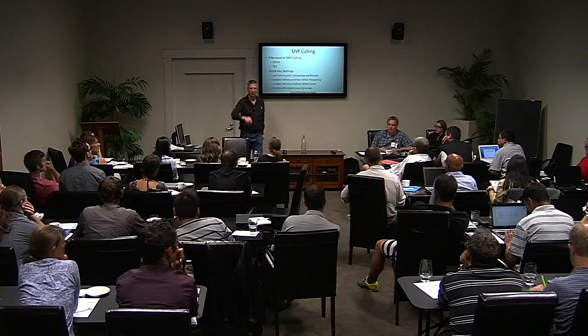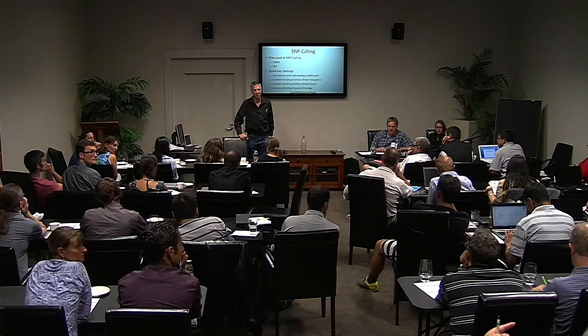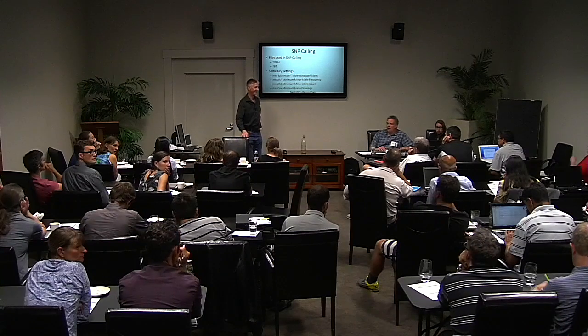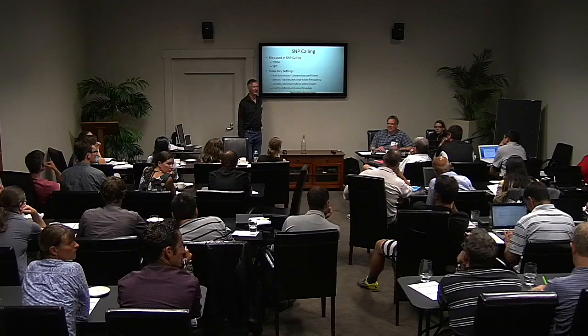Okay. John? There's obviously a little bit of magic in here too, because presumably if a read's going in this direction and another read's going in this direction, they can overlap. Yes, but we define a tag locus as things on the same strand with the same start site. You could have two tags that effectively pull the same stuff.